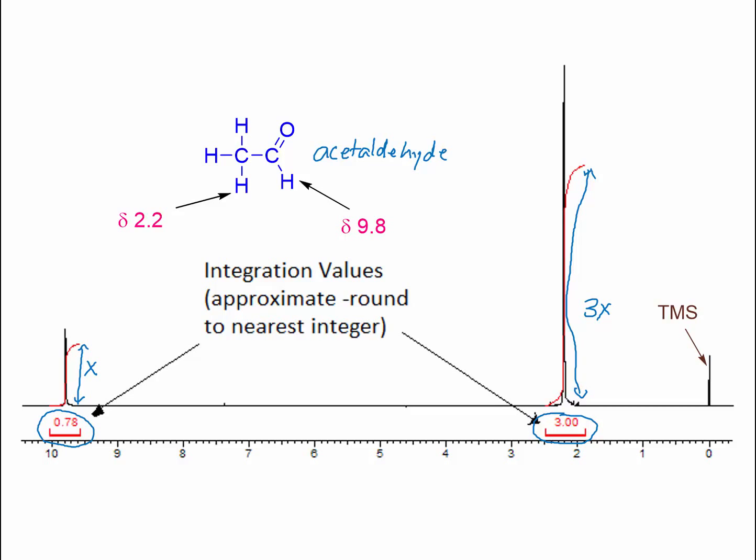All right, so there are a lot of numbers here. This number at the very bottom of the NMR spectrum represents the chemical shift. And these numbers right here that are specifically under each peak represent the integration values. They're usually rounded to the nearest integer, for a variety of reasons. Aldehydes don't integrate quite as well, but it's pretty close.